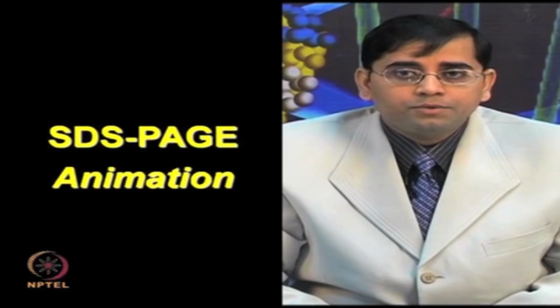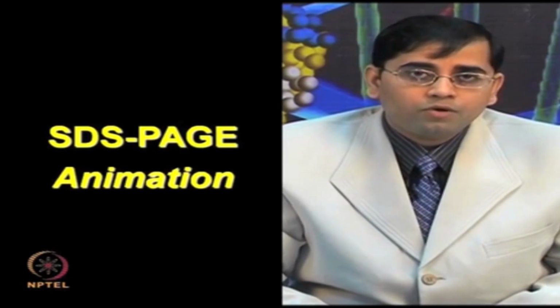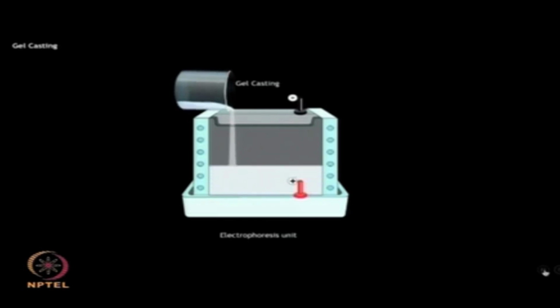I will now describe the animation and show you the steps involved in SDS PAGE. Sodium dodecyl sulfate polyacrylamide gel electrophoresis, SDS PAGE. In this animation, you will see various steps involved in separating proteins based on their molecular weight.